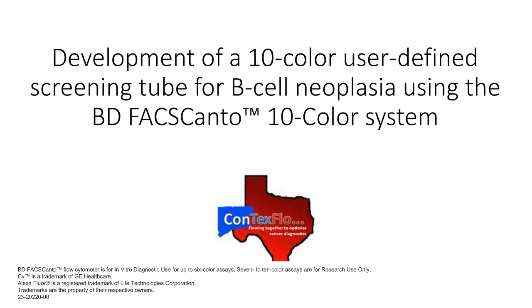Given the diversity of possible neoplastic populations, if you have anything atypical, it can be very confusing to interpret. And the other issue is, given the anti-CD19 therapies, we lose some of those background markers, and all of a sudden you don't know if you're looking at B cells or T cells. So we felt the best was to stack in extra B cell markers but keep the T cells and B cells quite cleanly separated.